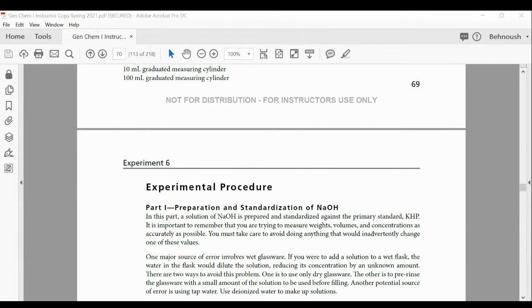Back titration is used when you have a weak acid or a weak base. Let's say you have an antacid. You know what an antacid is? You take Tums or Alka-Seltzer or something that helps an upset stomach, because your stomach is acidic, and an upset stomach means too much acid. When you take an antacid, it soothes. Basically, it neutralizes or lowers the acidity. So an antacid must be basic.